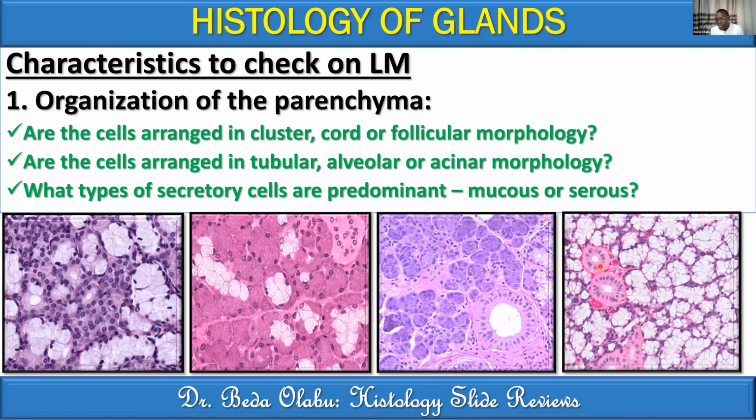So the secretory portion of this gland is predominantly mucus. We see hardly any serous acini here. These 3 or 4 that we are seeing are ductal portions. Again, confirming that that is an exocrine gland, and in particular, a mucus exocrine gland.